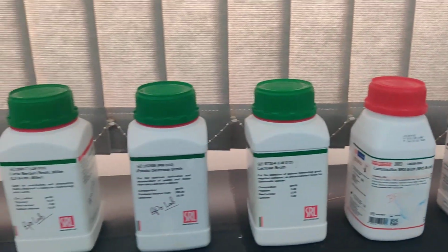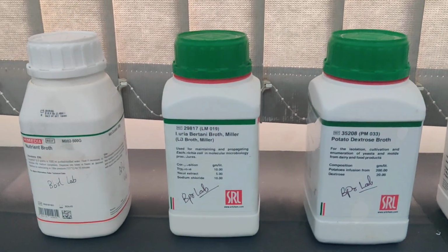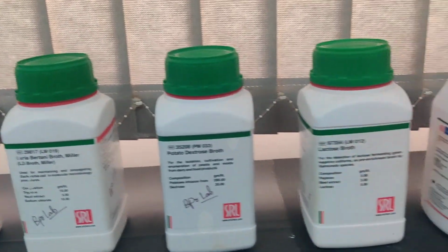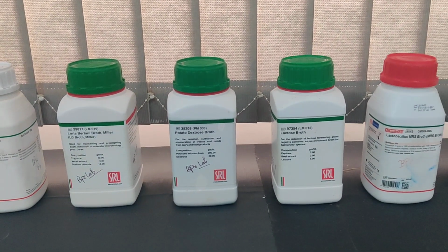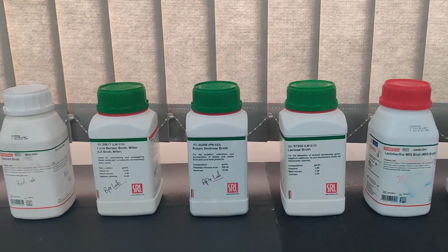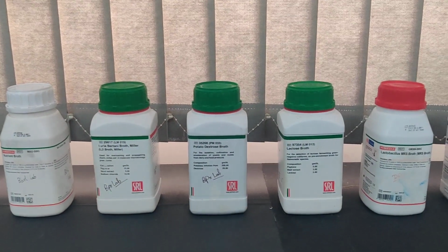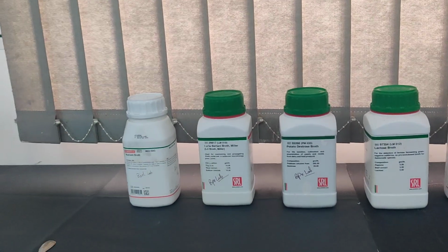This is very important, because there will also be LB agar, Luria Bertani agar, nutrient agar, potato dextrose agar, lactose agar. But if agar is there, it means it is a solidifying medium. That means you use it for solid and semi-solid mediums, which we will see in tomorrow's session. Today we are just going to explore the liquid broths.